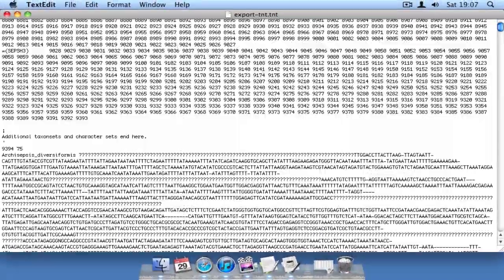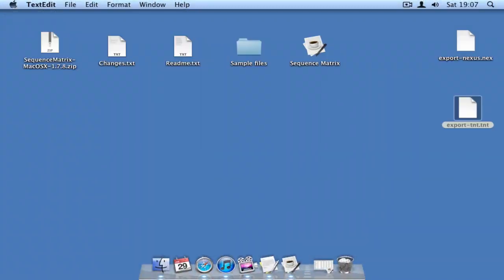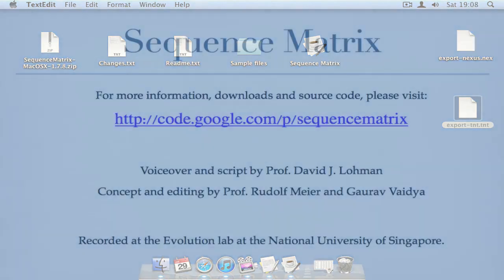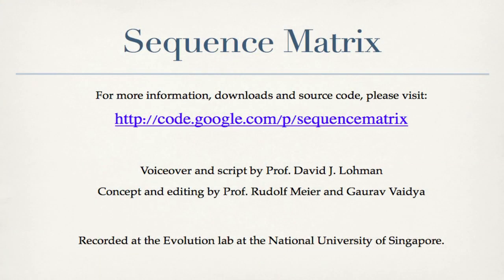This video has explained some of the basic functions of Sequence Matrix. To find out more about using this program, watch some of our other videos, which explain how you can use the program to explore your data and highlight potential errors.